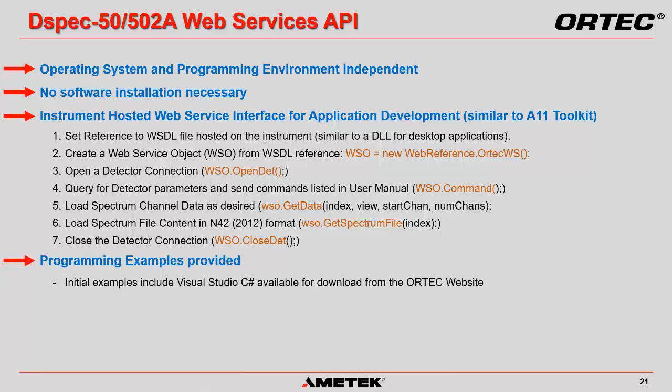A programming example to help customers get started is available from the ORTEC website on the DSpec 50 page, and we're anticipating more examples to be available in the future.